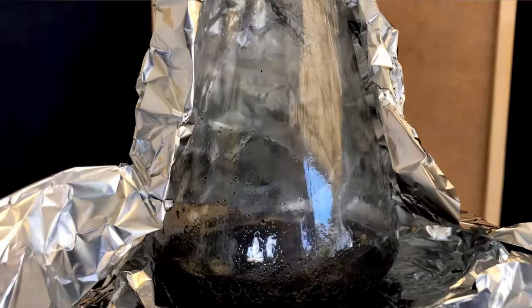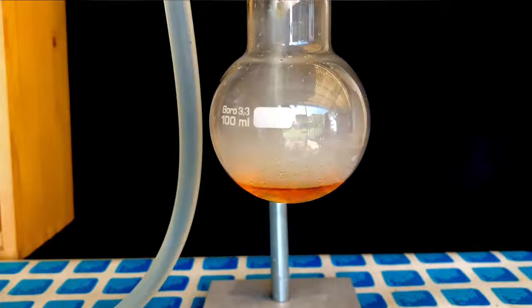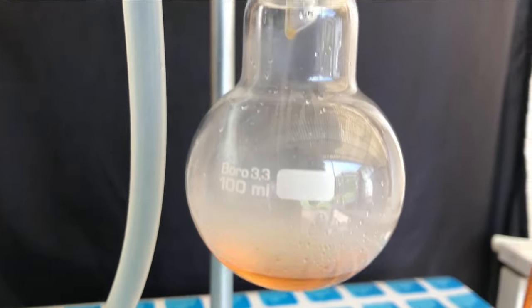Aluminum foil was still used to speed up the distillation, as I hate to wait. Only 20 minutes after the start of the distillation, everything had distilled over. The Bunsen burner was now turned off.